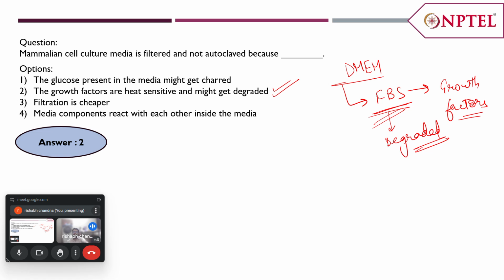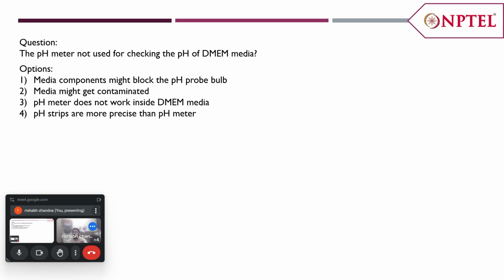Okay, if not, then we'll move on to the next question. The pH meter is not used for checking the pH of the DMEM media because... what can be the correct answer?